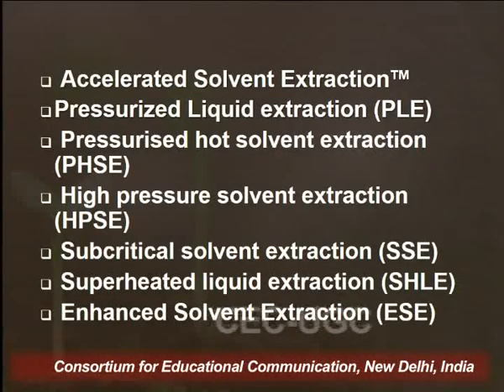Now there are different names given to pressurized solvent extraction. One I have already discussed, that is accelerated solvent extraction, which is a trademark name registered by the Dionex Corporation. Now PSE is also known as pressurized liquid extraction or pressurized hot solvent extraction. It is also known as high pressure solvent extraction, subcritical solvent extraction, superheated liquid extraction, or enhanced solvent extraction.